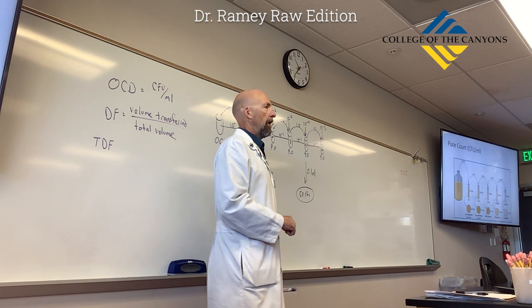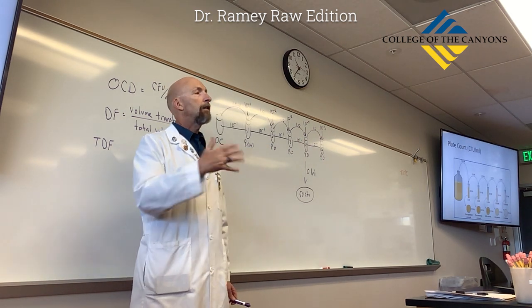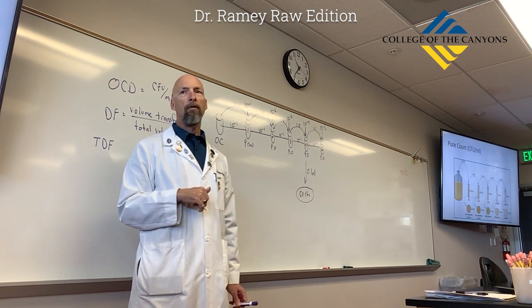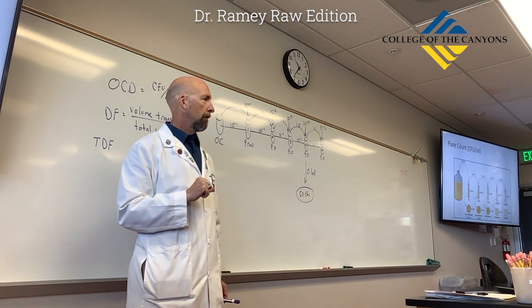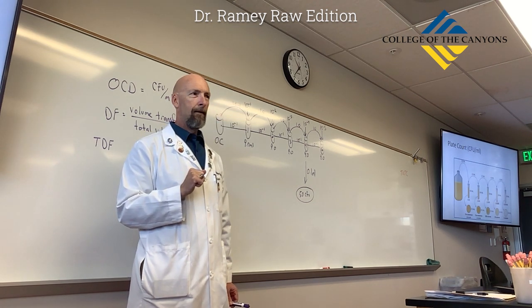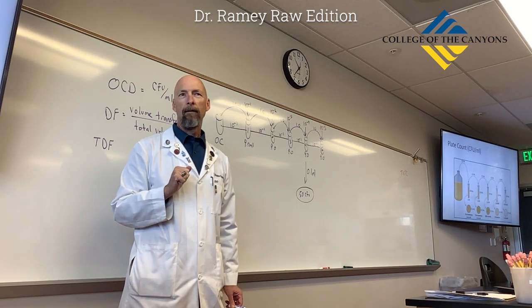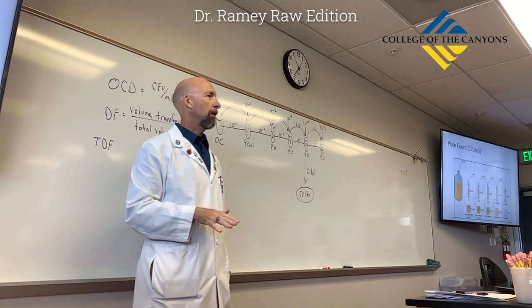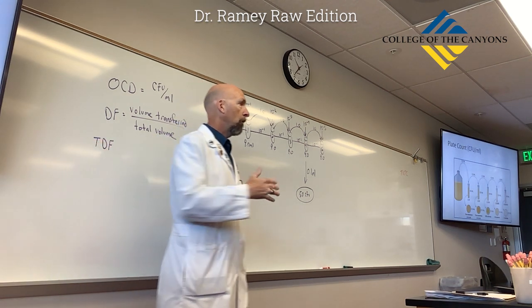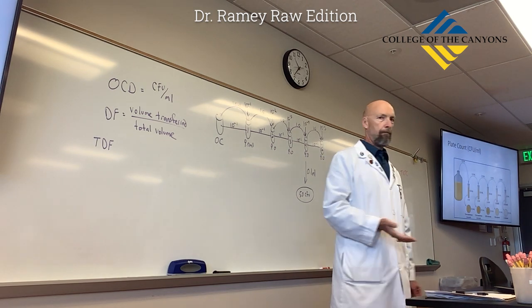That means that if everything goes correctly and you do everything right, it's almost impossible to have 2 of your plates in the 30 to 300 range. There's one exception, and that is if you have one plate that's 30, then you would expect another plate to have 300. So it's not impossible to have 2 plates in the 30 to 300 range. But they're all off by a factor of 10, so you would not expect that to happen. Does that make sense? Okay.